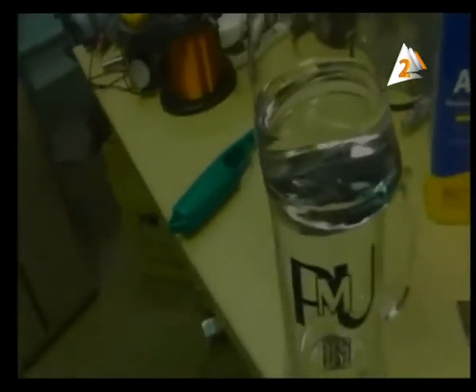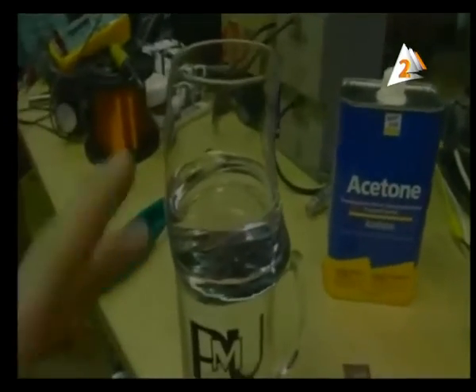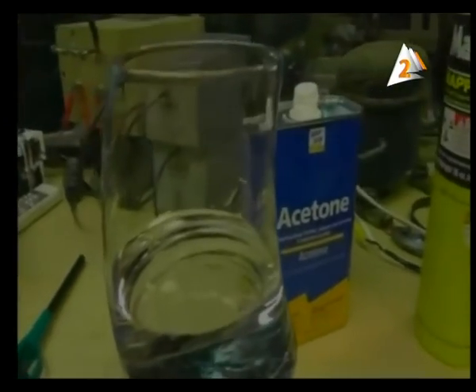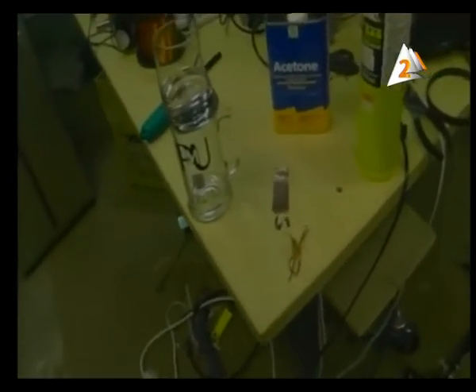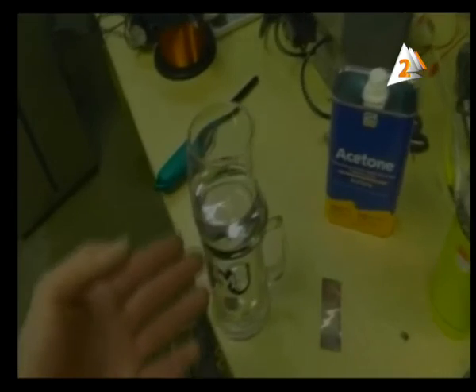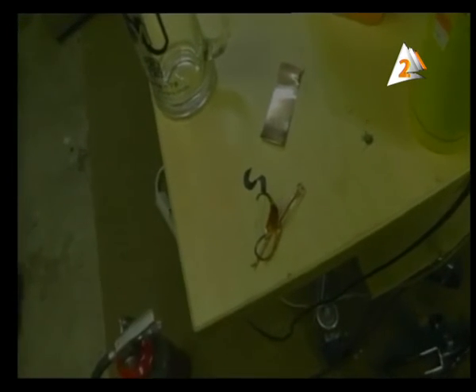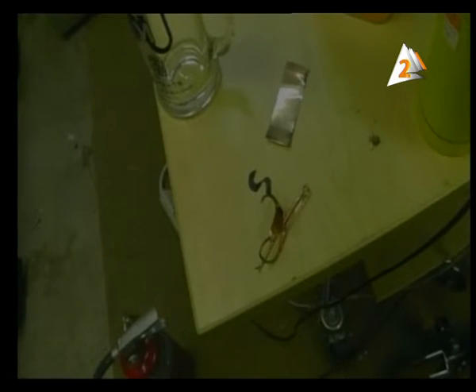Yes, we have acetone, tell me what happened. When you get these tubes which contain the liquid of acetone and put it in this normal shape. Now, concentrate on the material, this important lab. The amount of the acetone is not high, but we want to know if the reaction increases or not. Does the reaction of the piece of copper and acetone stay as it is or increase? This means you have a catalyst.